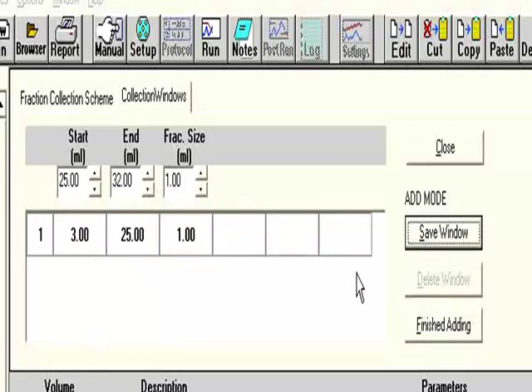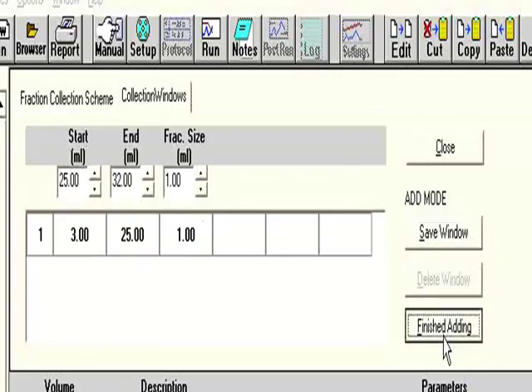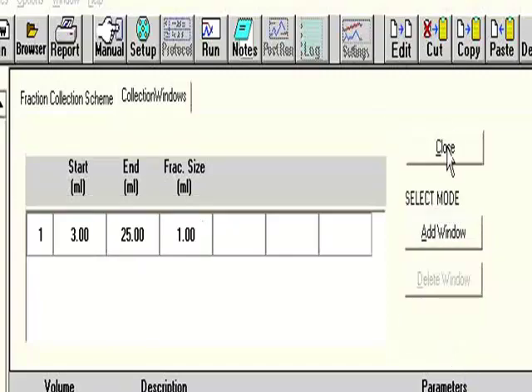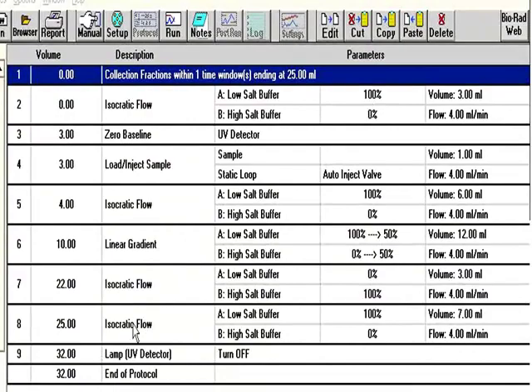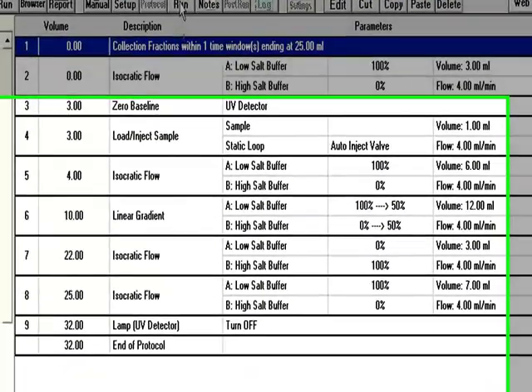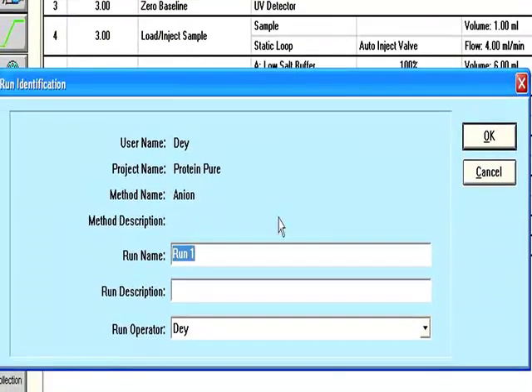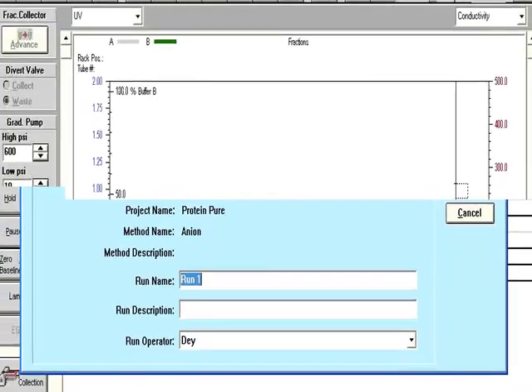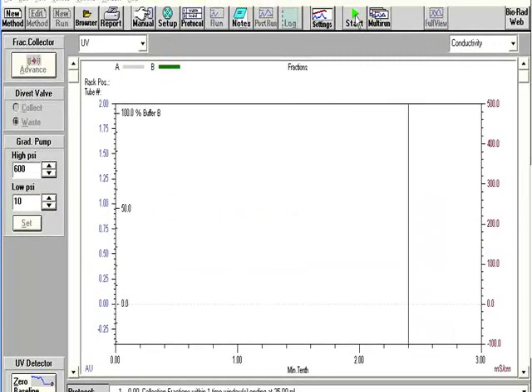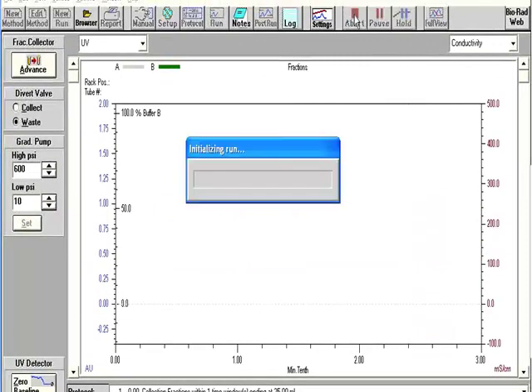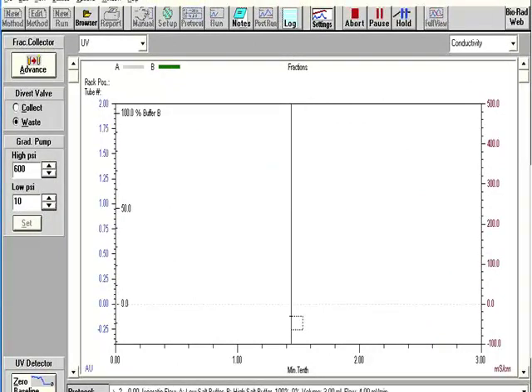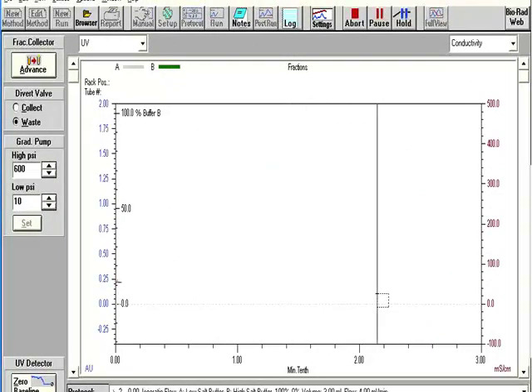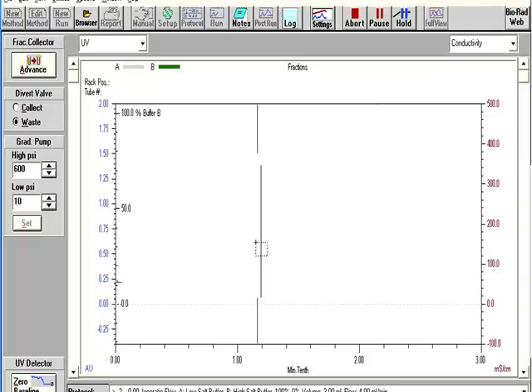And now we're ready to run our method. Click run. Call method name. Click OK. And start. And you are running a method. And it's as simple as that to set up the software for the Dual Flow program.